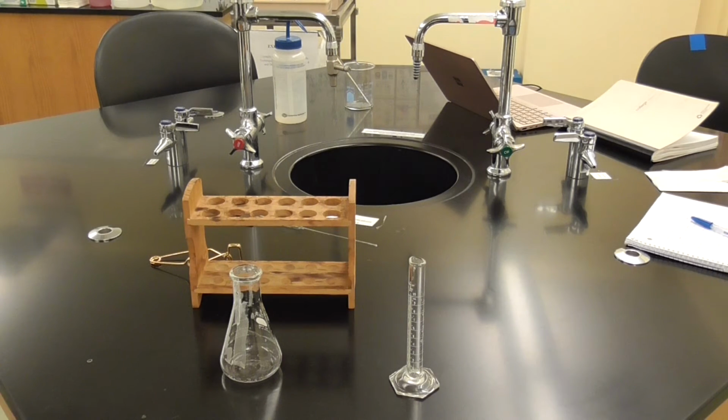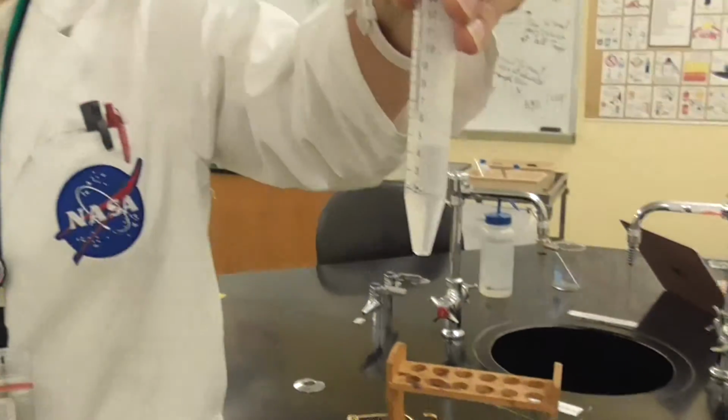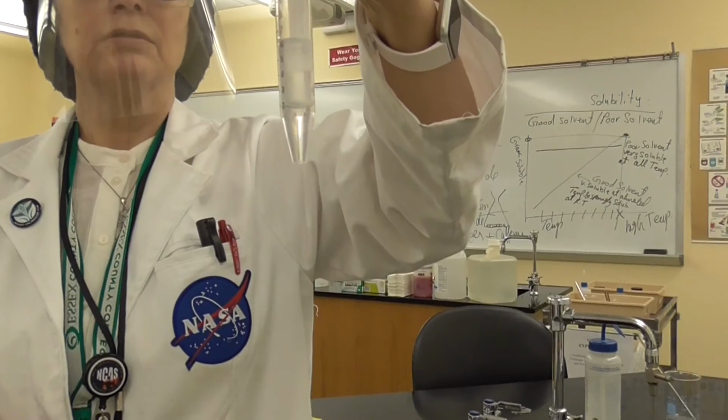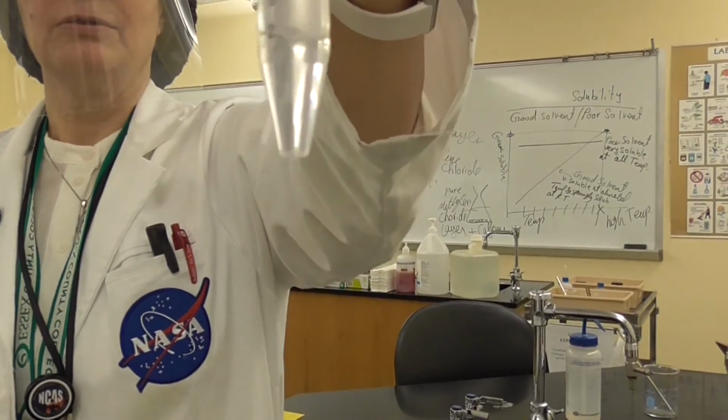So now you're doing the same thing with the second. Did you give it a good mix? Yes. All right. So we wanted to transfer most of the caffeine from the water layer into the organic layer. That's why we want to mix it. And then you see here it's very clear that it is going to have the two layers. Okay, you see that?